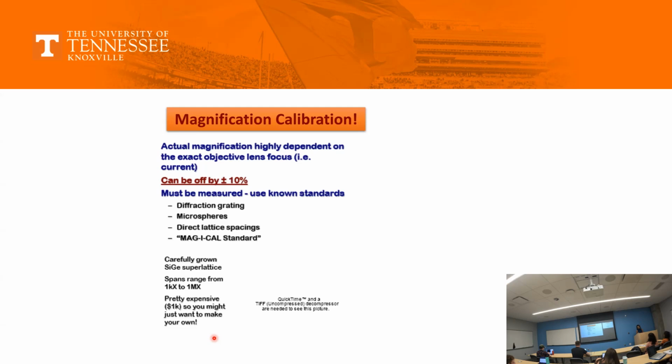Most of the time, even when I was a student, I broke it so many times, and it's natural. But 10 years ago, the technology wasn't great, I would say. The one that we have in GIAM is very automated. Here, you don't do a lot of condenser alignment, but if you go to a lab like Oak Ridge National Lab, any TEM lab, they have old microscopes, where, the way I told you, you align each condenser step by step.